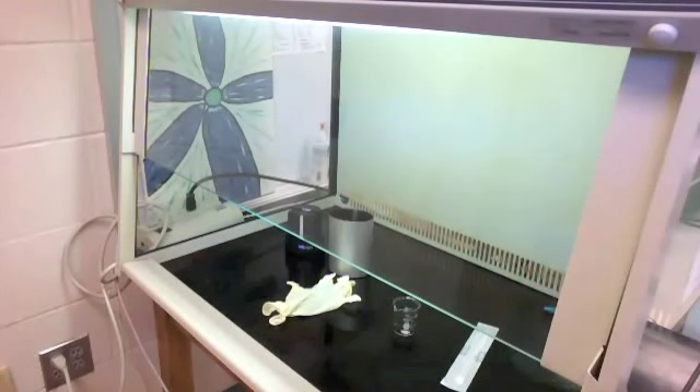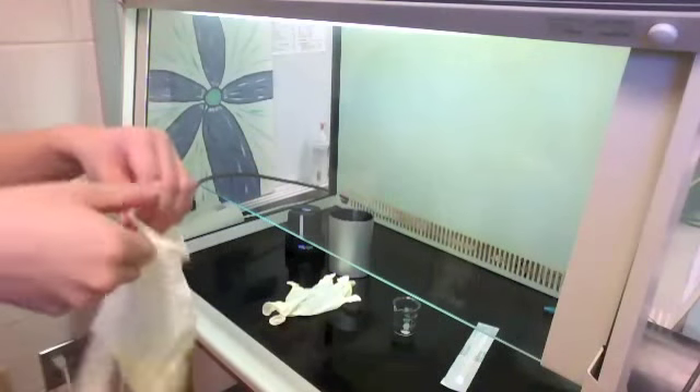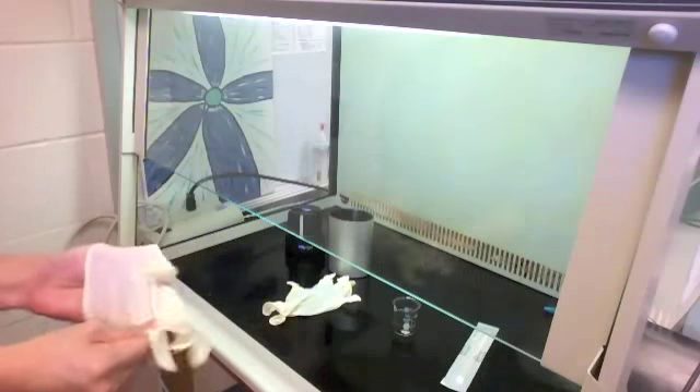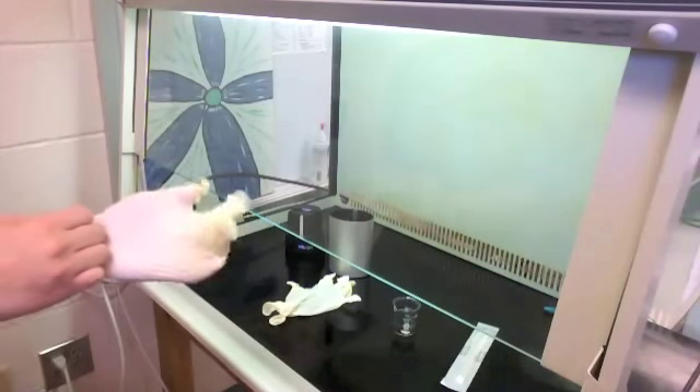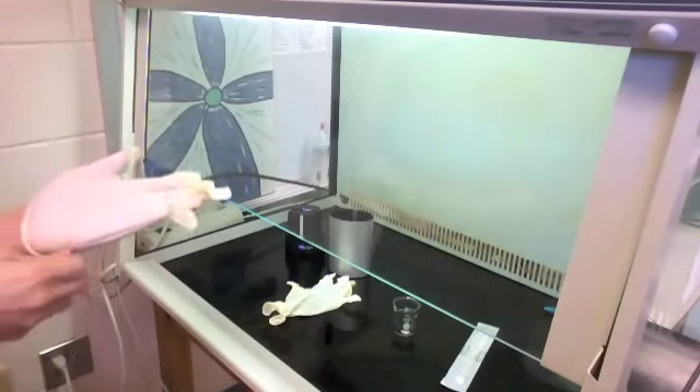Now I'm slipping on gloves, and the reason I'm having a lot of difficulty is because I sprayed my hands with ethyl alcohol — as you probably know, putting on plastic gloves with wet hands is not an easy task.